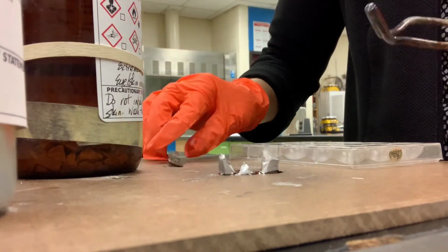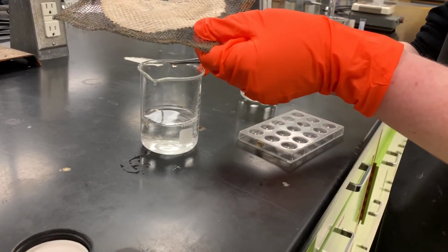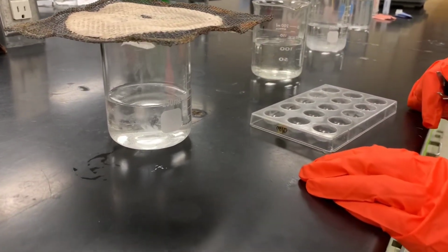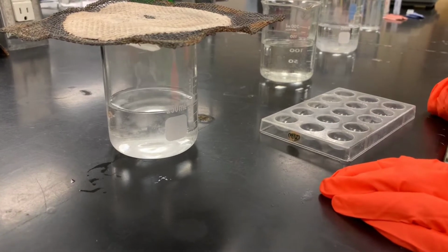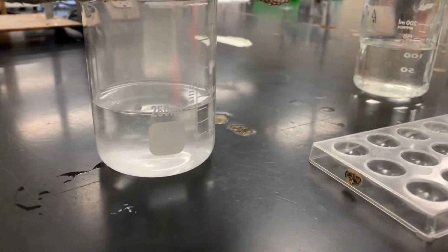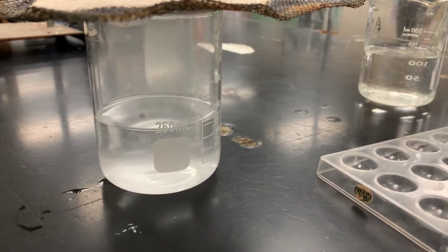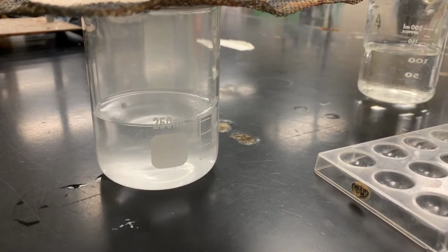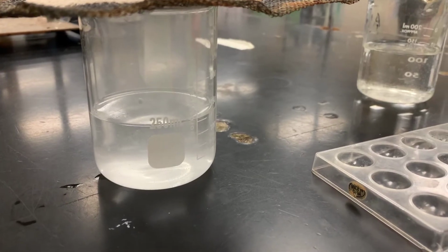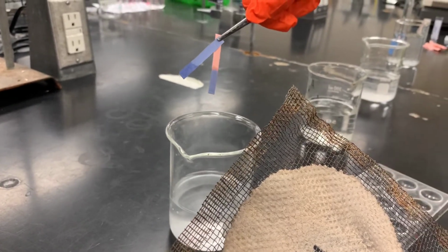We're going to put a piece of that into our spot plate. So we're going to put a piece of the sodium in the water. We're going to make our observations. Once that finishes reacting, we're going to test our solution with some litmus paper. Blue stays blue and red turns blue.